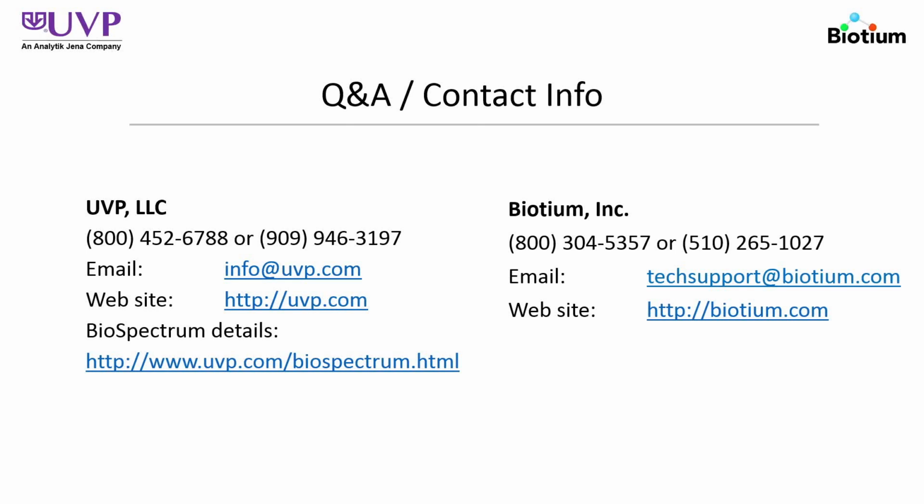Yeah, sure. And the other half of the question of what's left in the gel is to determine if the membrane has bound all the protein of interest. And particularly with nitrocellulose, if it is not stored properly, it can be stored out in the open in high humidity environments. It can lose its capacity to bind proteins. And so during the blotting process, the proteins don't stick as well.